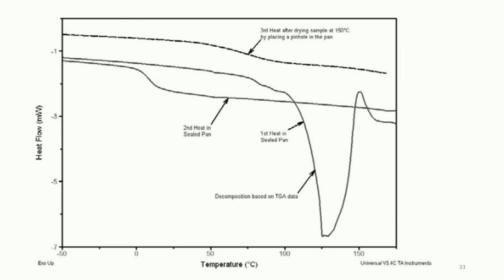So increased sensitivity and resolution is quite an important advantage of modulated DSC over traditional DSC, because it helps us measure the small thermal events that occur during the temperature scan of that particular sample, from its melting point to the glass transition temperature.